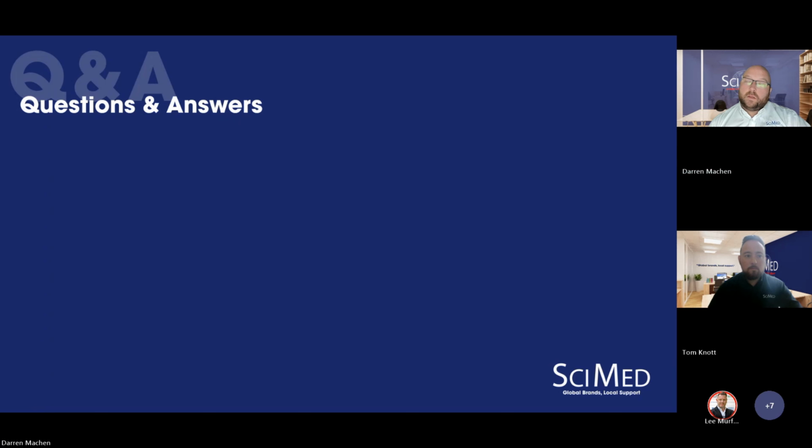Yeah, it can be very scary. With an XRF, you have a calibration against a known material. It's much easier to understand that. For companies that have used NIR for many years, they have a chemometrician, which sounds like a very scary word, but it's somebody who understands trends in data. The software is always improving to make some of the applications easier.